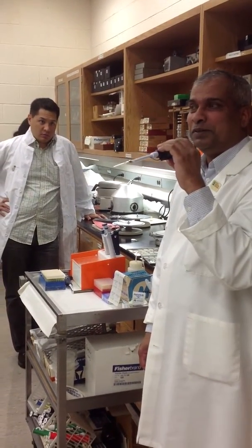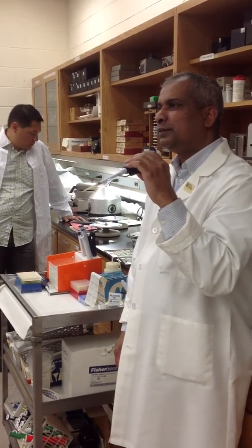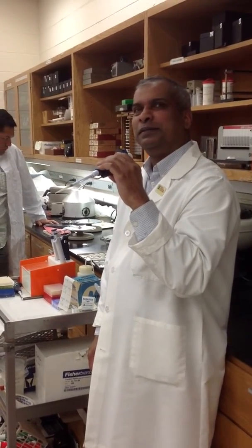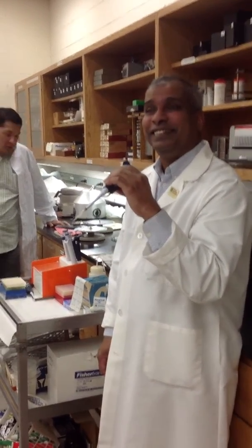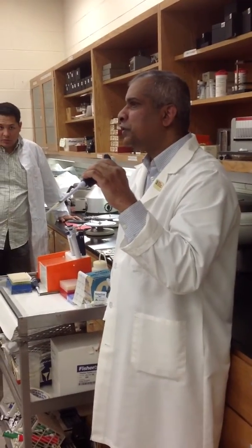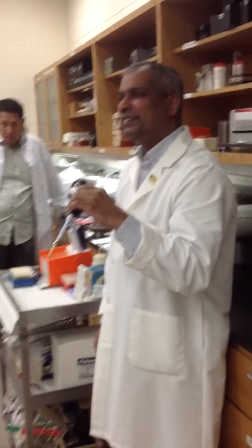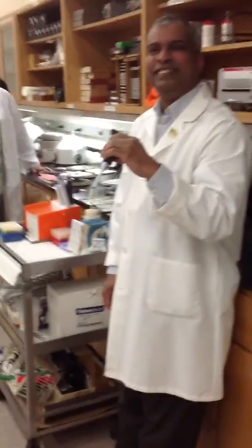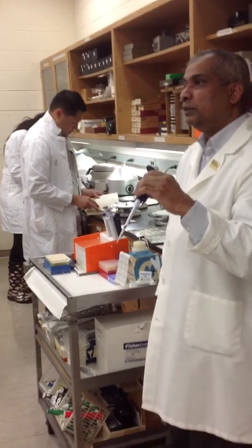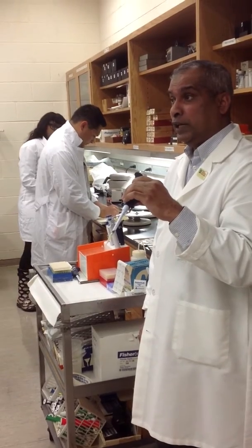How many microliters are there in 1 ml? It's 1,000, right? So you add 3 zeros. So 0.125 is how much? 125 microliters. Oh, right, that's true. Microliters, right? That's a millionth of a liter.